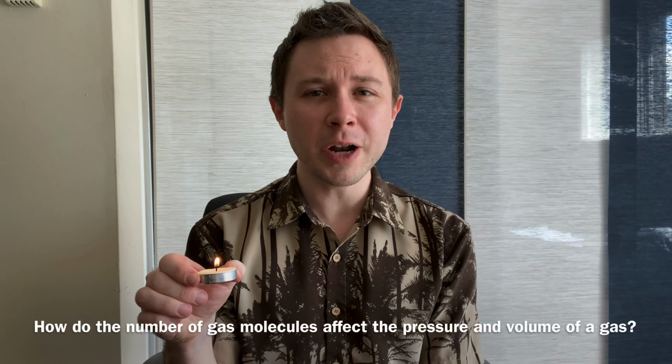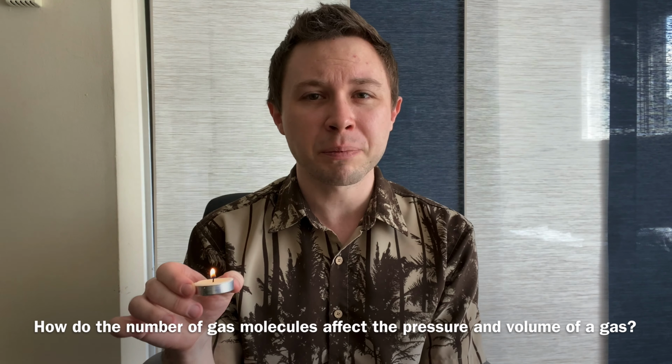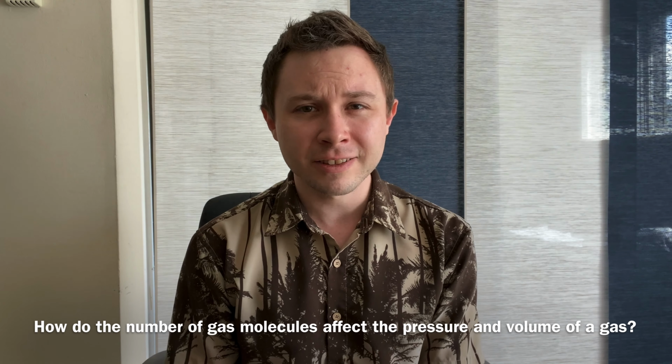In our experiment today, we're going to use the candle to decrease the number of gas molecules in a container of gas. And while that's happening, we're going to monitor the internal pressure and the volume. Our experimental question is, how do the number of gas molecules affect the pressure and volume for a gas? Let's take a look.